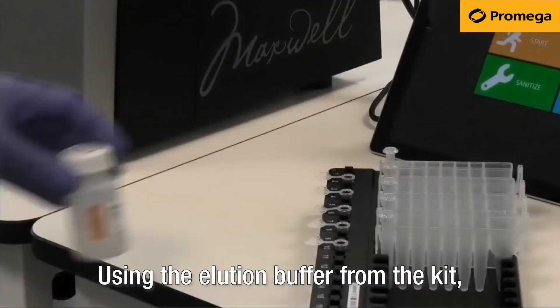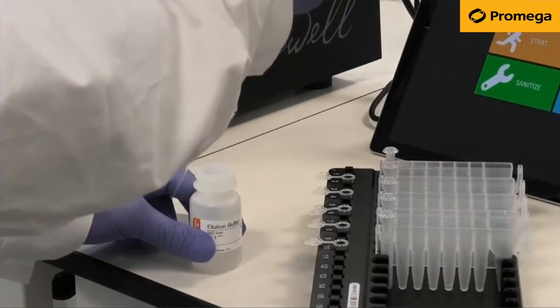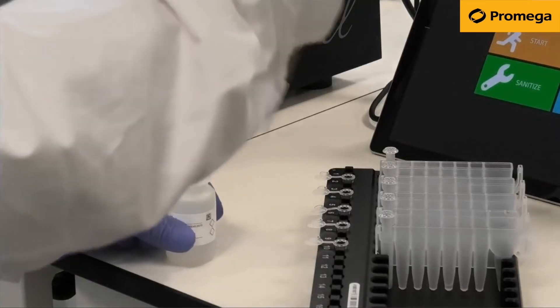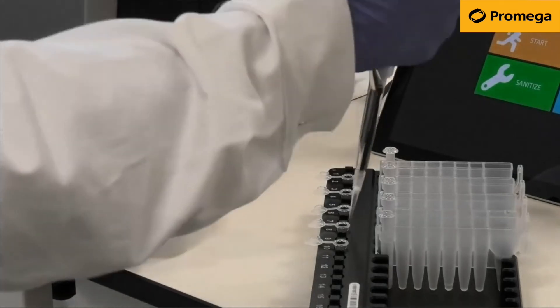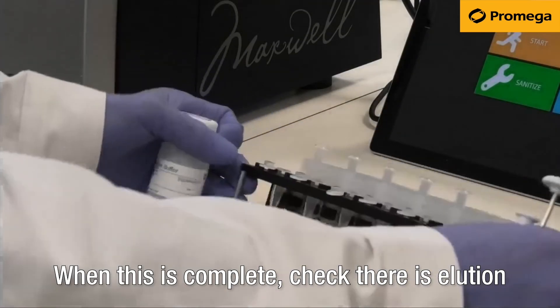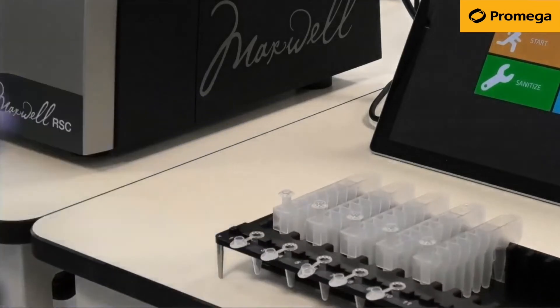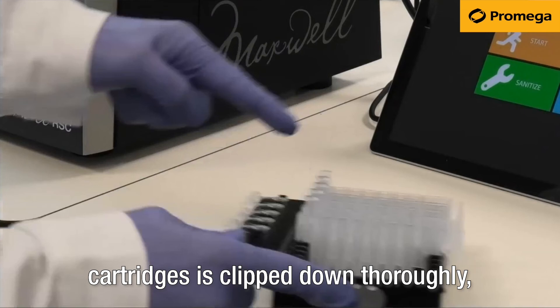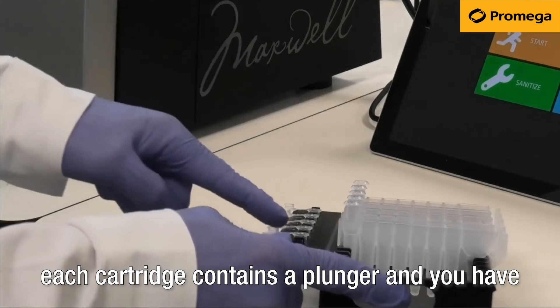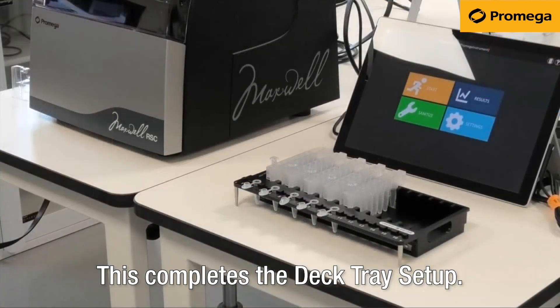Using the elution buffer from the kit, pipette the correct amount into each elution tube. When this is complete, check there is elution buffer in every elution tube. This is a good time to check that each of your cartridges is clipped down thoroughly, each cartridge contains a plunger, and you have an elution tube in the correct position, filled with elution buffer and the cap pointing downwards. This completes deck tray setup.